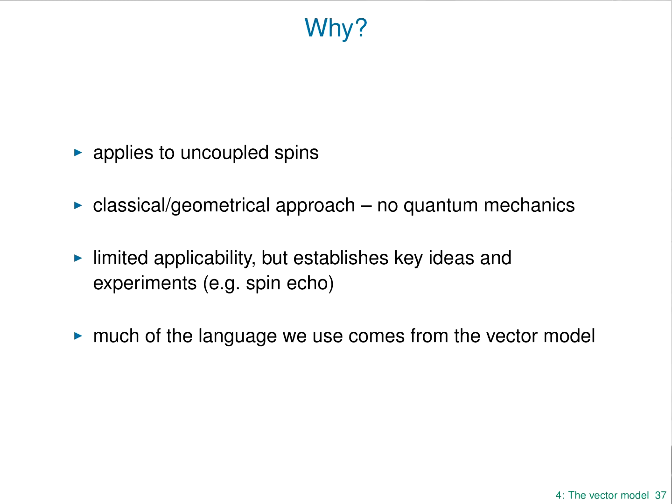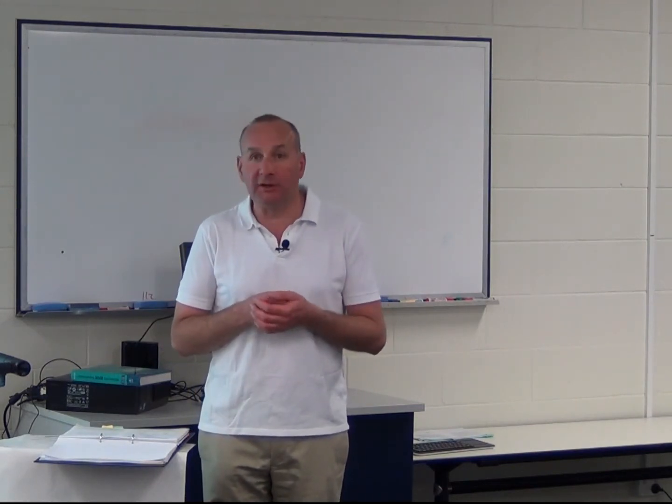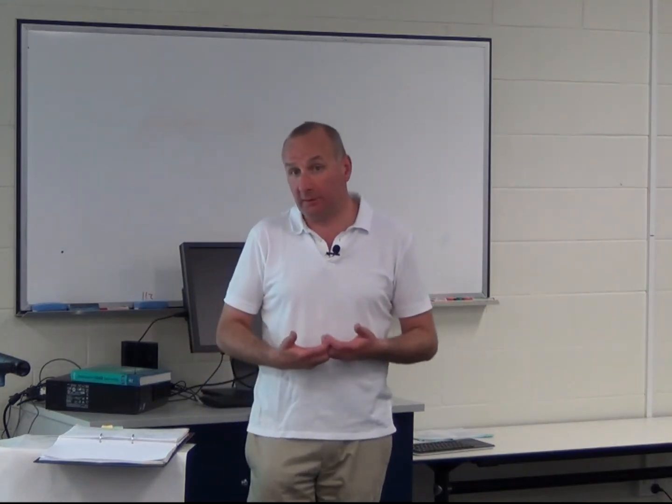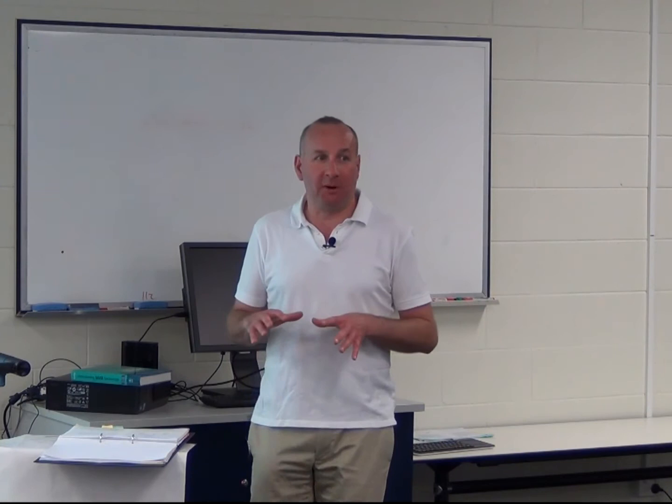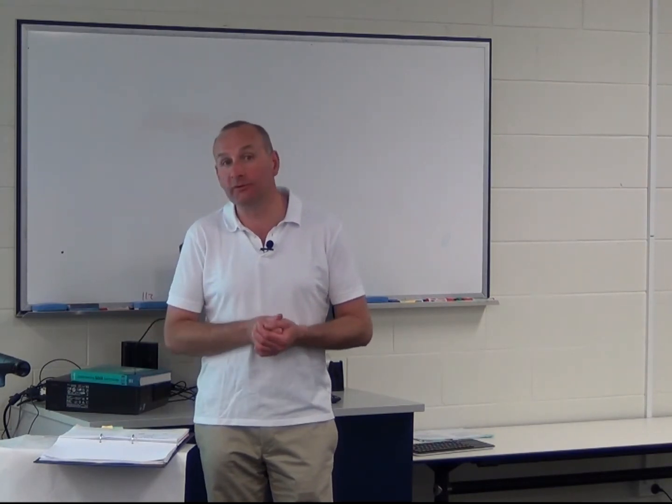And finally, the language we use to describe NMR, a lot of it comes from the vector model. So when we look at product operators, which is a quantum mechanical description which will work for coupled spins, we're going to use language which comes from the vector model. So I make absolutely no apology for spending time on this model which only applies to uncoupled spins, because it lays the foundations for understanding the basic experiments, and it also lays the foundation for the language which is used in most other NMR experiments.